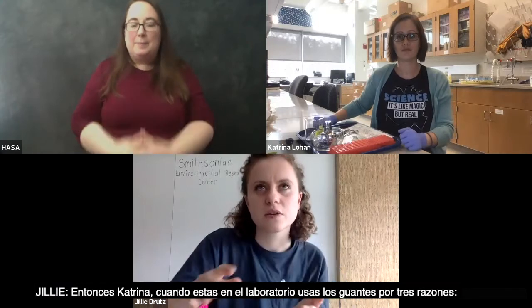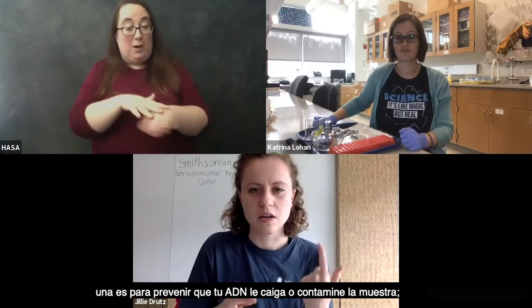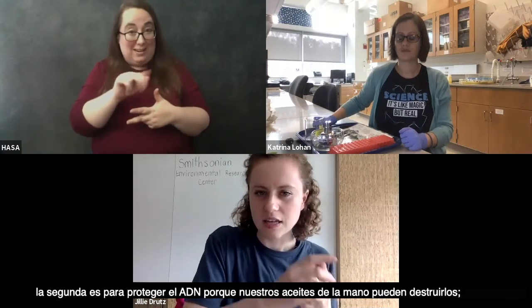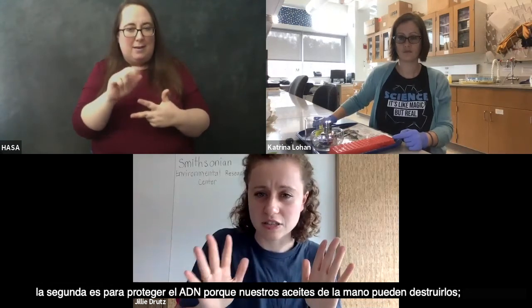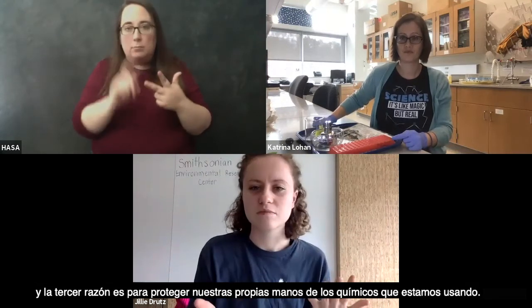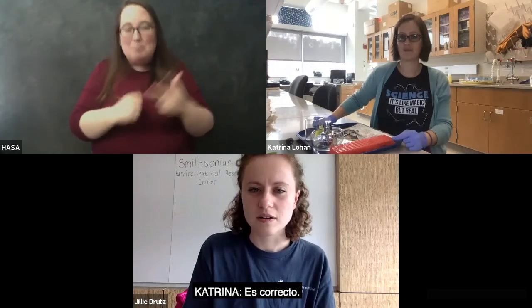Okay, so Katrina, when you're normally in the lab, you wear gloves for 3 reasons. One is to prevent your DNA from getting in your sample. The second is to protect the DNA, because the oils on our hands could destroy the DNA from our sample. Wow, okay. And the third reason is to protect our own hands from the chemicals that we're using. Correct, that's right. Okay, cool.